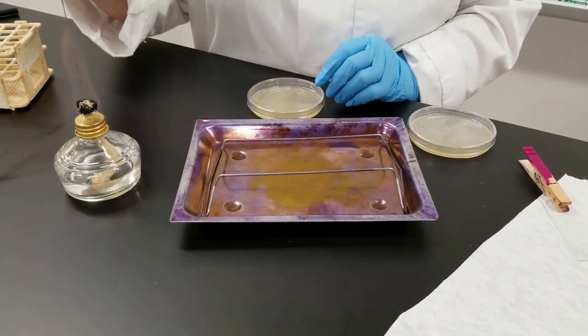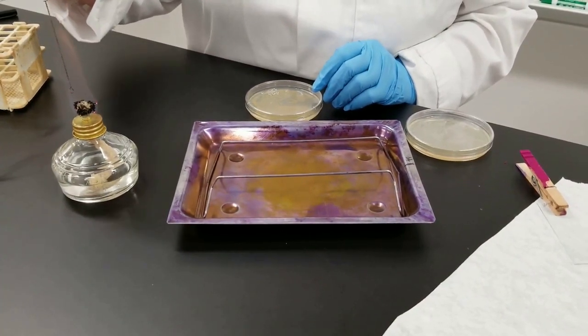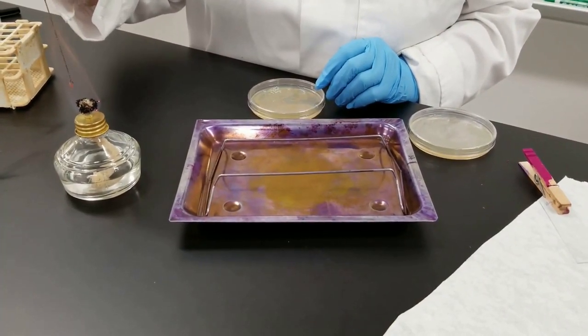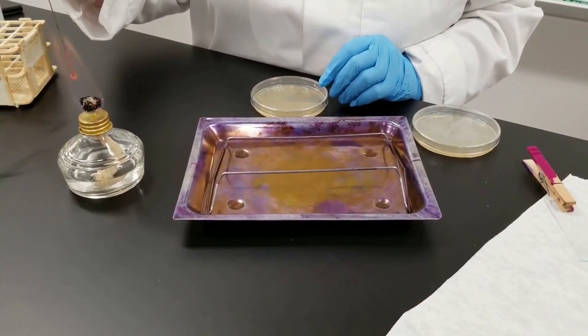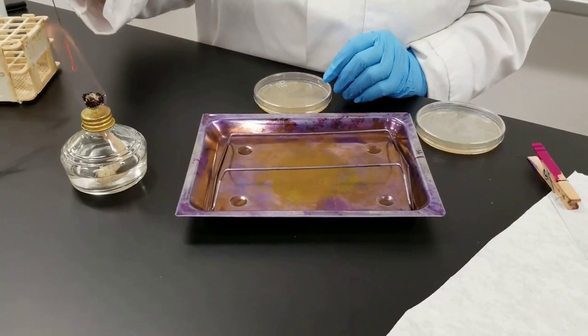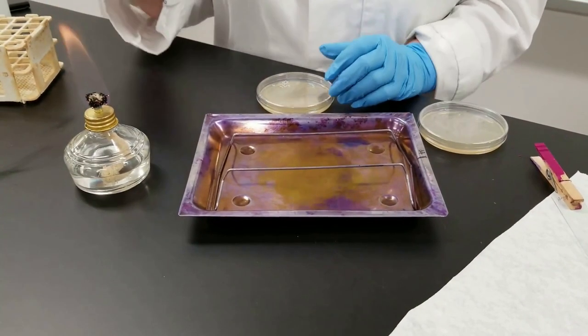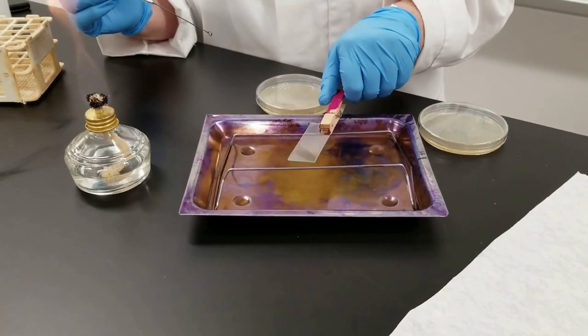Okay, so what we're going to do now is a Gram stain, a differential stain. It uses two different dyes, that's why we call it differential. You can distinguish between different bacteria on here. So first thing we're going to do, as always, flame our loop. We have a slide ready to go here.